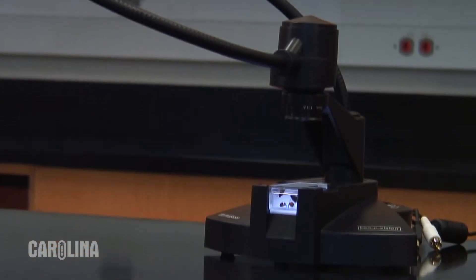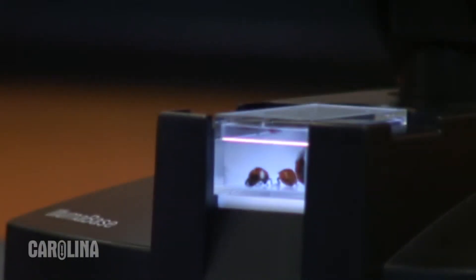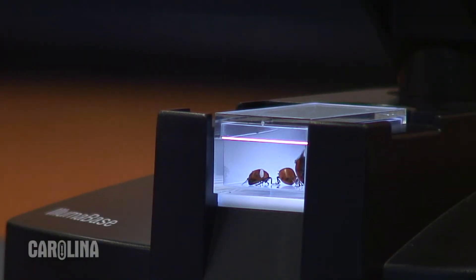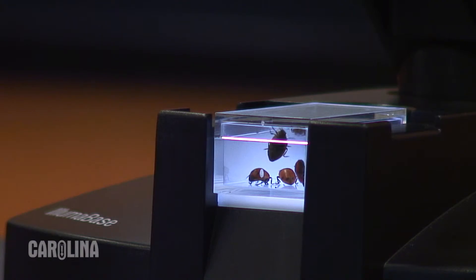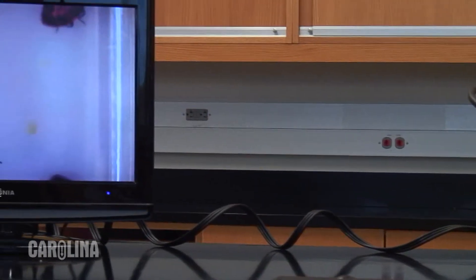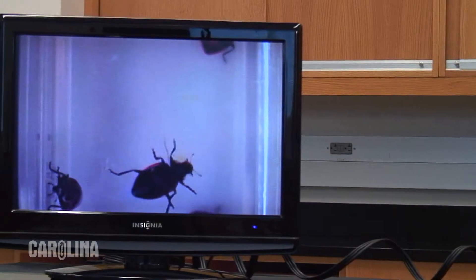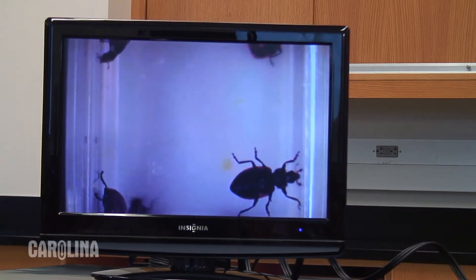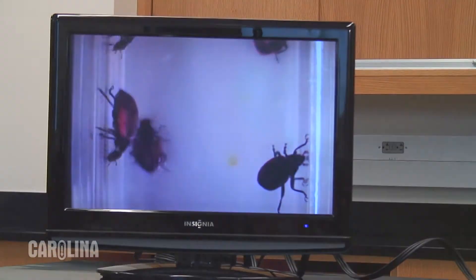The aluma base is a unique lighted specimen chamber that allows various lighting options. It evenly illuminates specimens from three sides, which is particularly useful when viewing small living creatures such as ladybugs and small spiders.